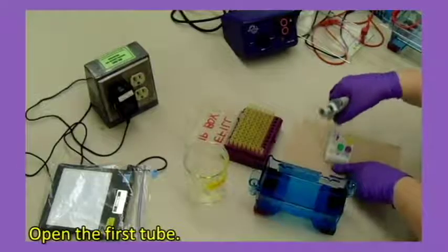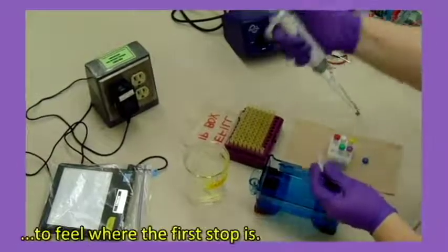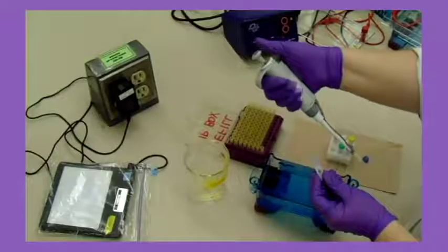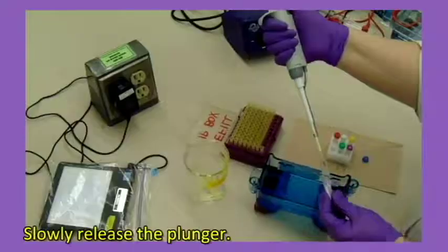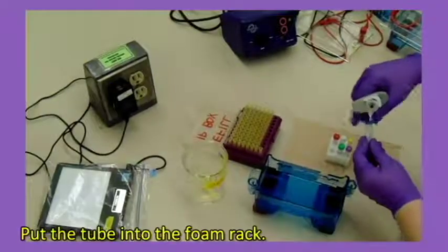Put a yellow tip on the micropipette. Open the first tube. Press the plunger down a few times to feel where the first stop is. Press down to the first stop and hold. Place the tip into the DNA. Slowly release the plunger. Put the tube into the foam rack.